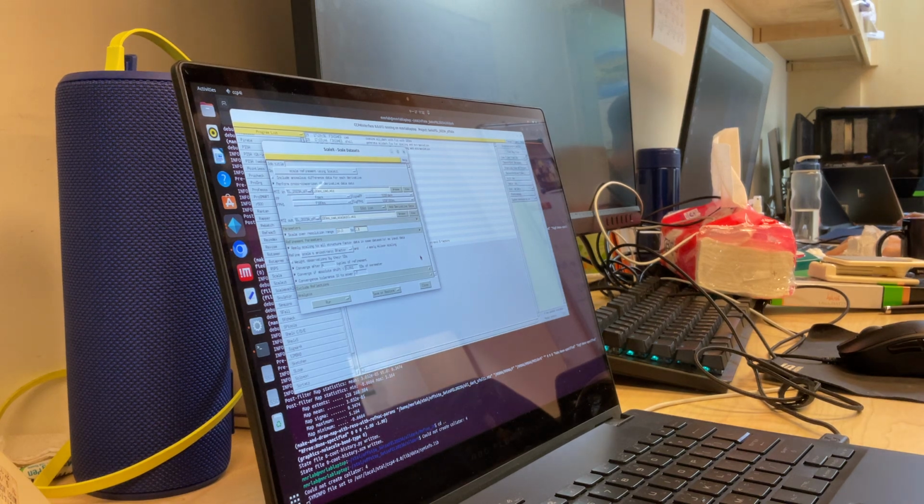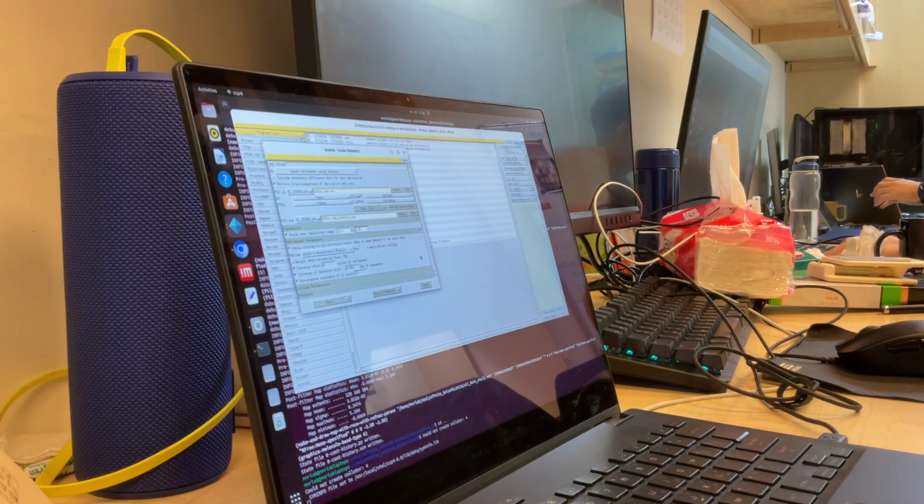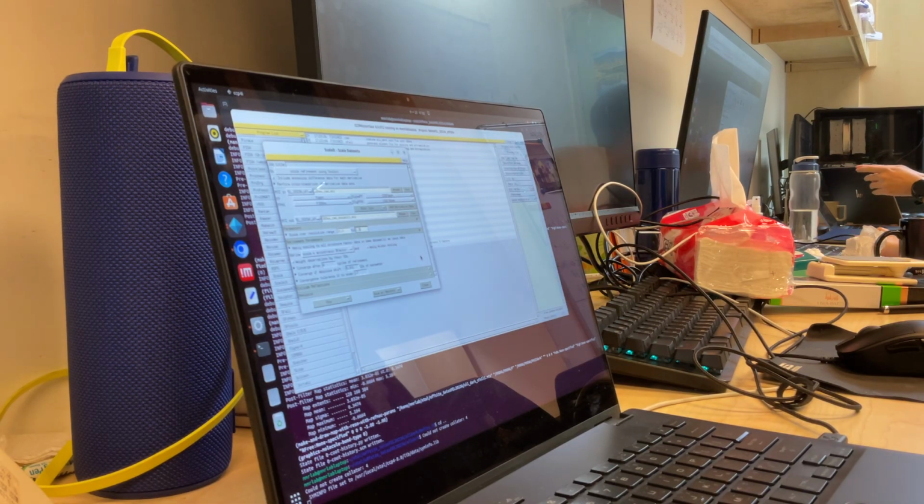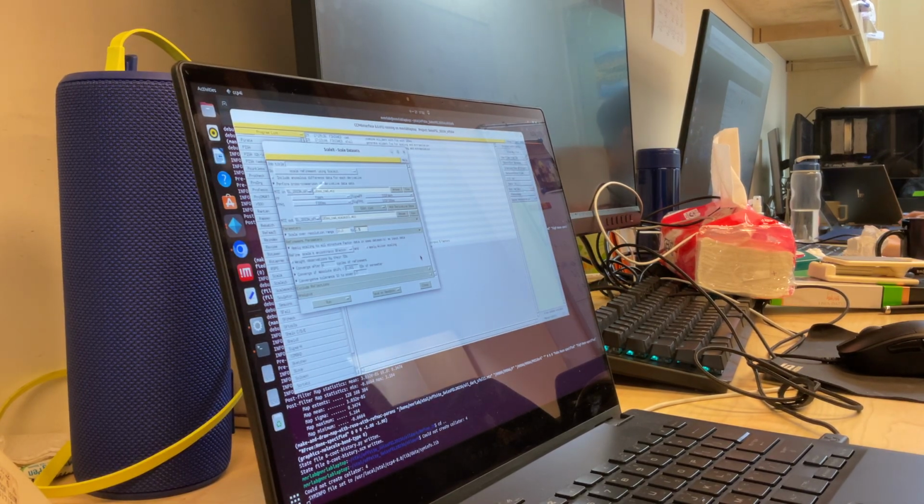So if your detector has a saturation curve that looks like this, and you're somewhere here, maybe actually your value should not be this one, it should be maybe here. You see what I mean? But because you're close to saturation, it's a bit lower than it should be, because it's not in the linear range anymore. And so that means that it can do weird things with your scaling if you have something like that. It doesn't affect the refinement very much, but it can affect the scaling quite strongly.